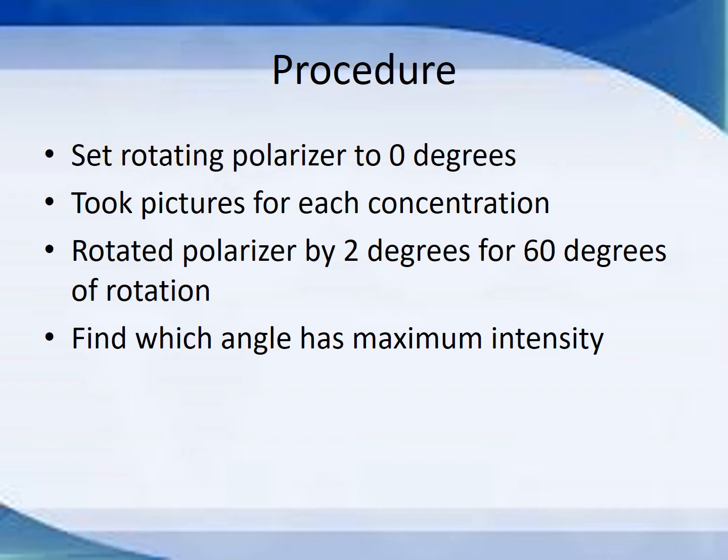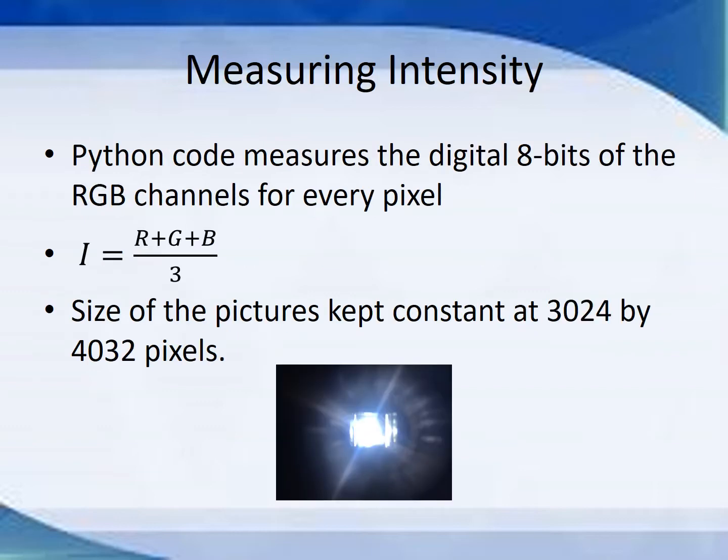Basically, we were trying to find which angle has the maximum intensity, because that would indicate the angle of polarization of the light after exiting the cuvette of the optically active solution. To measure the intensity, we had Python code that basically measures the RGB channels for every pixel.